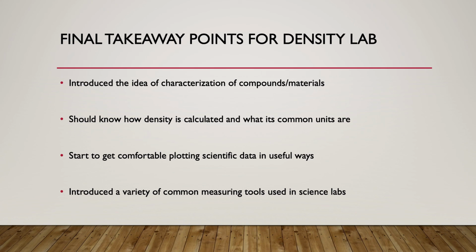Likewise for mass, there are general procedures such as zeroing things properly and making sure everything is always recorded to the third decimal place for grams. Now it's an easy tool that we're used to using, because it is something we'll use frequently throughout the rest of the year.